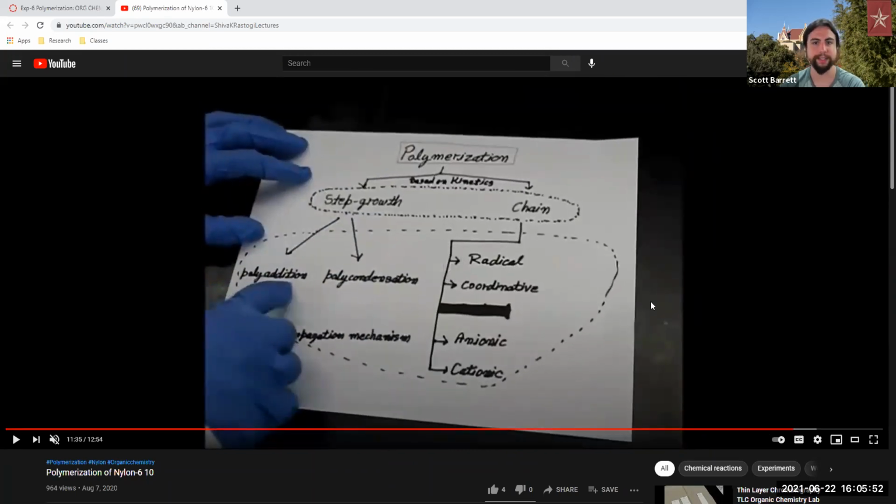And then, so this is more knowledge towards the difference between step growth and chain reactions. And this is good for review for yourself. Otherwise, I would go forward into taking the data that I'll be providing for you. I'm going to take the list of everyone in our class and then give you some data that you can analyze. Very simple. The real work today is going to be in the post-lab questions. The data, all you have to do is just do your actual yield, and then that's going to be it.